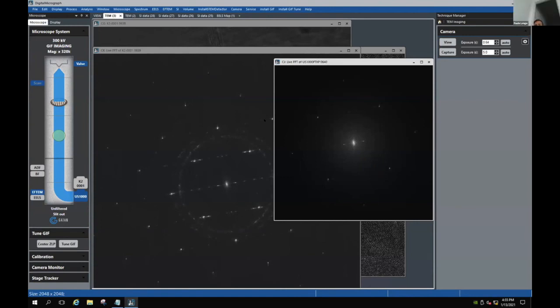It's also key to have the microscope perfectly aligned. Not by you, but in your case by the FEI engineer, because when you change the magnification you want to make sure the illumination stays constant. You don't want the illumination to change all of a sudden. You want the illumination with respect to the detector to stay the same, the beam spread in the same way, and the beam not to shift. These are actually key conditions in the case of cryo-EM, because you go from extremely low magnification mode to higher magnification.